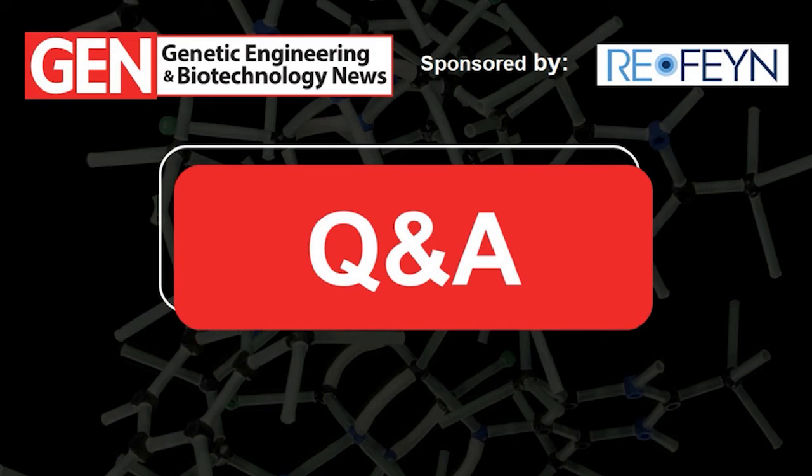All right, thank you for that. Next question we have is, and I just want to let you know, can the MP resolve partially filled AAVs and be able to determine partial genome incorporation from the empty and full distributions?